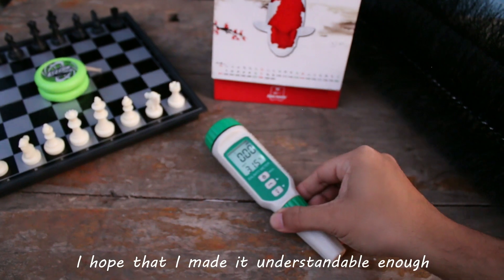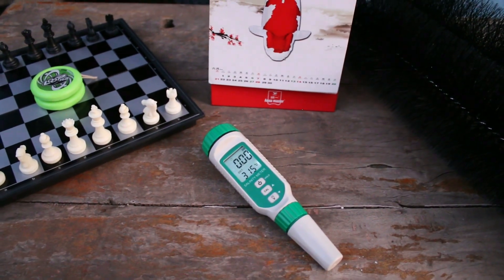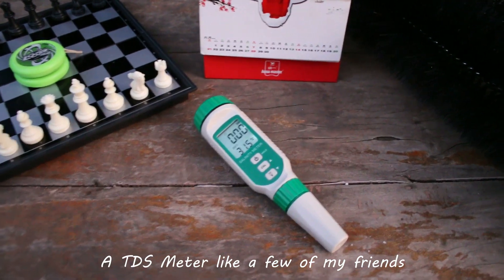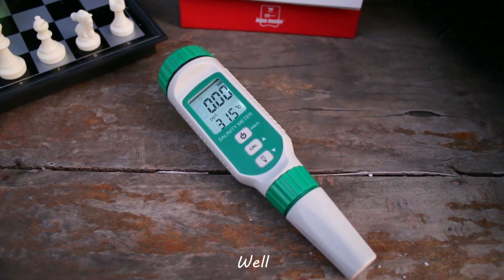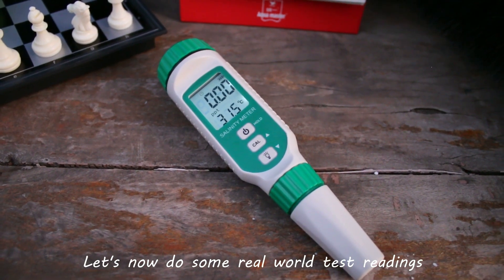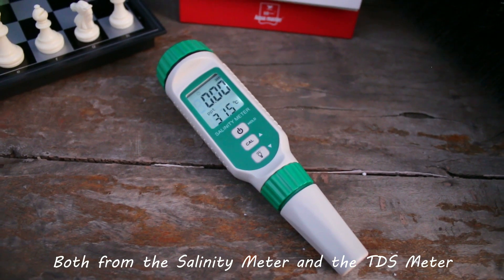I hope that I made it understandable enough for all of you, so that you won't make the mistake of purchasing a TDS meter like a few of my friends in the hobby. Well, let's now do some real-world test readings so you can see actual results, both from the salinity meter and the TDS meter.